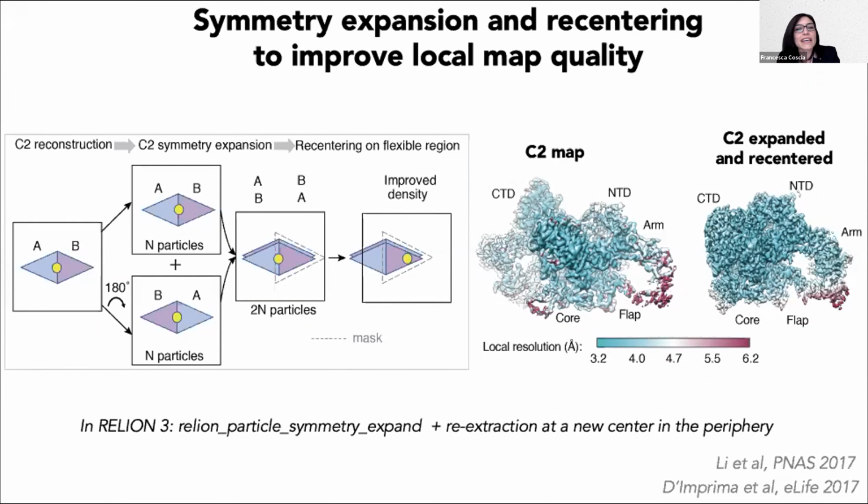You never control exactly how much is iodinated. So one should do controlled in vitro iodination, try to reproduce exactly what happens, and then classify out the iodinated from the uniodinated. This is in progress. It's on the to-do list. But yes, it will be very interesting to see the hormones bound to it.